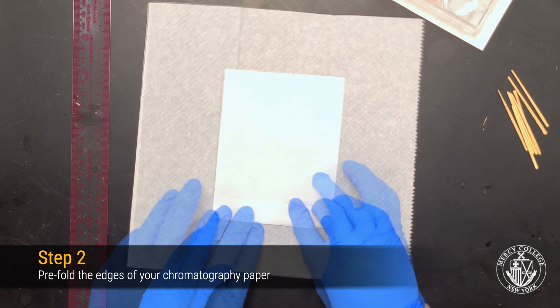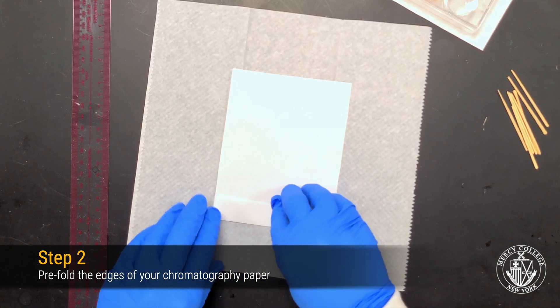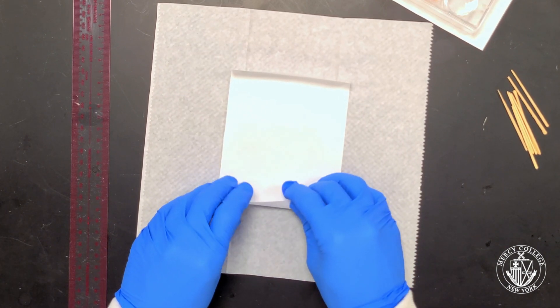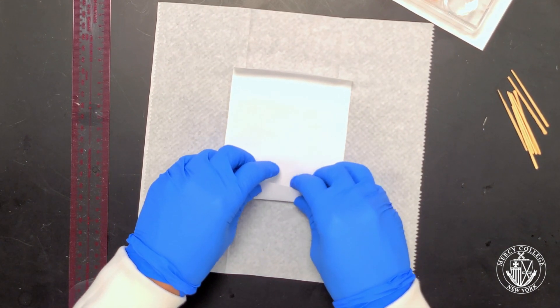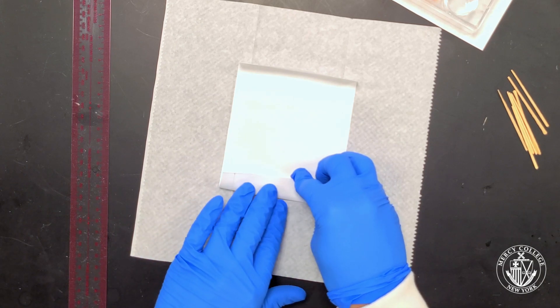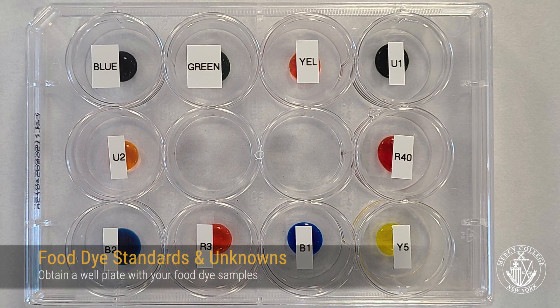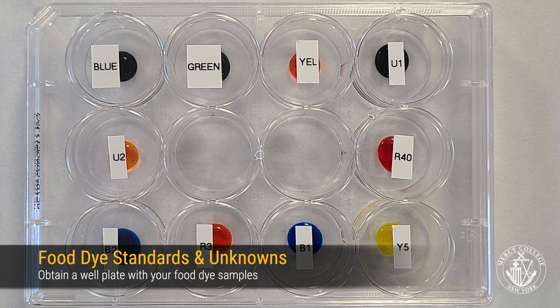It's helpful to complete these steps on a paper towel rather than directly on the lab bench, because you don't want to contaminate your chromatography paper and you don't know what substances there might be on the laboratory bench. For your chromatography experiment, you've been provided with a set of 10 food dyes or mixtures.